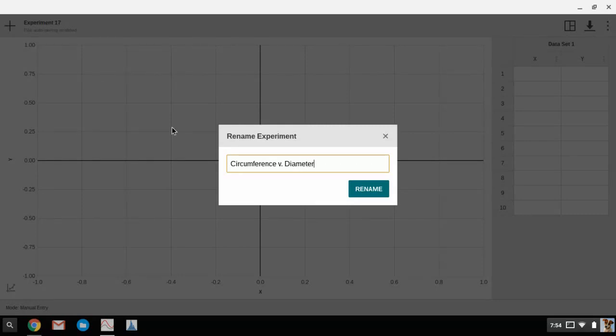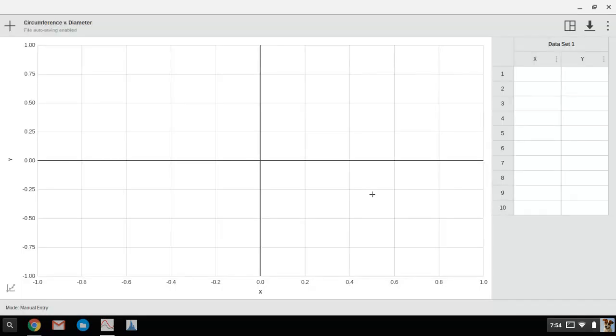So you'd name it whatever the name of your experiment is, that way if you need to come back and look at it later, it's not just some random experiment number, it's the actual name of your experiment.